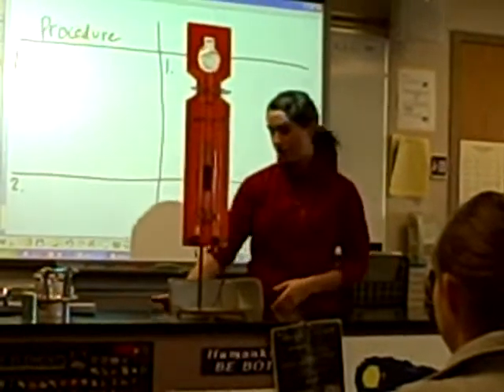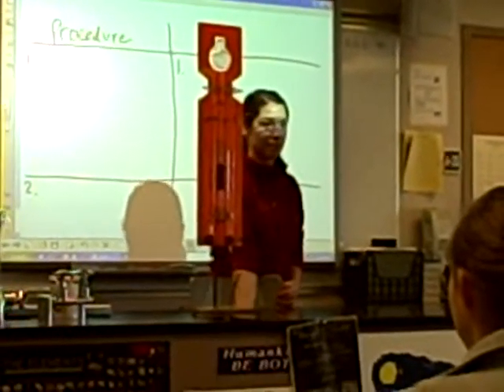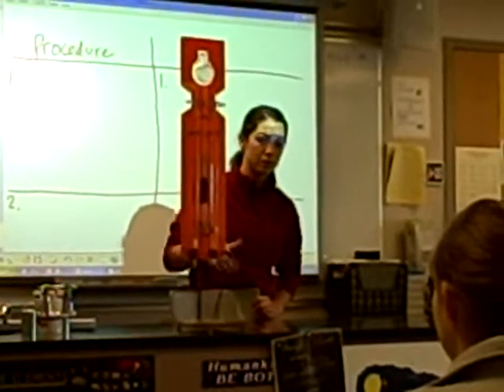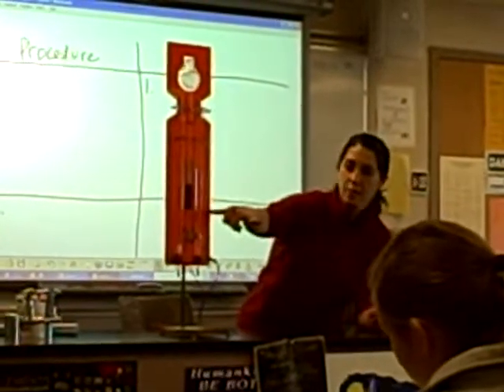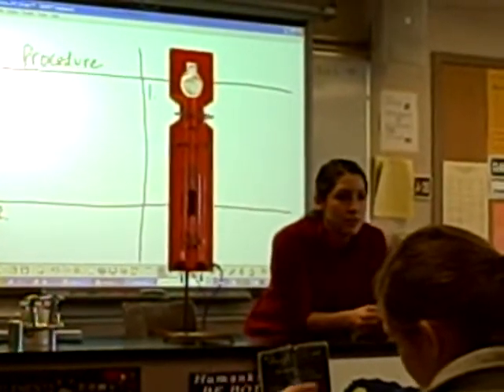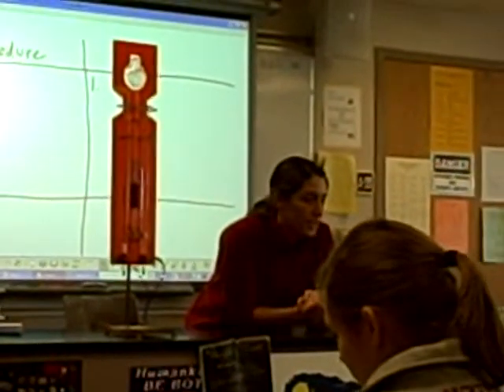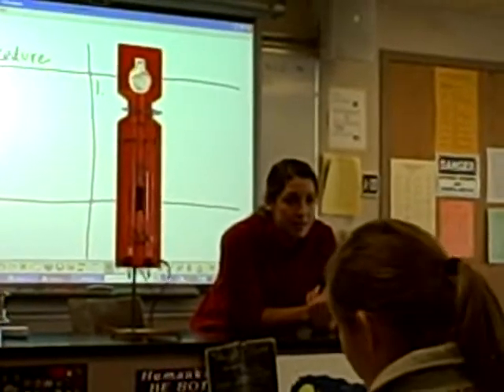Okay, and back here, I don't know if you've seen it before, but there's this green box back here. You can plug the electrodes in, flip the switch, electricity flows through. In here, what's in here? What did it tell you? Water. Okay, so does water conduct electricity? Yes. Yes, that's why you don't dry your hair in the bathtub.